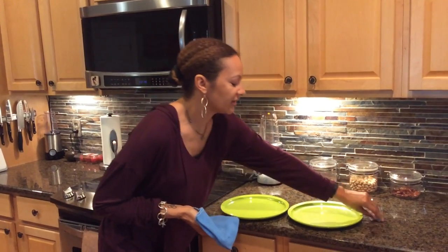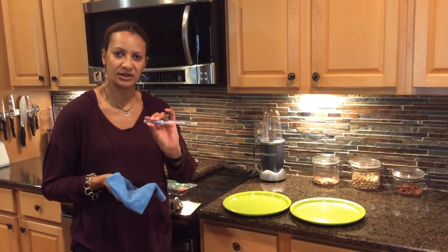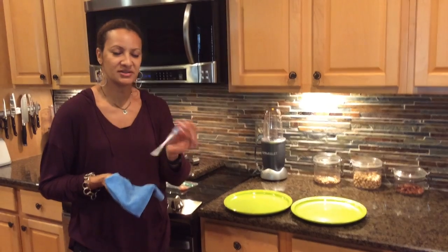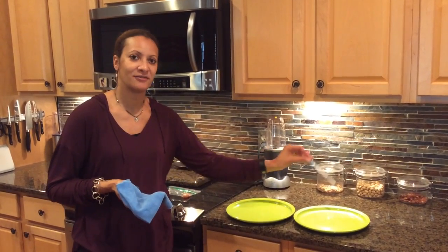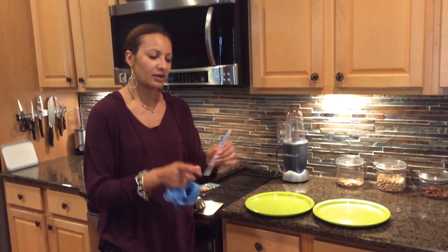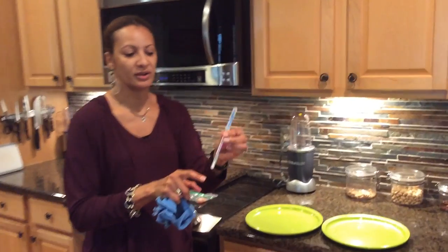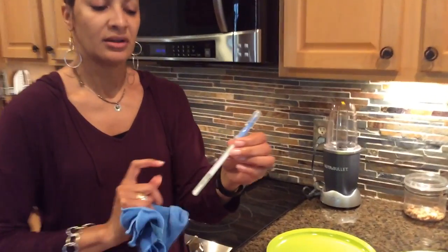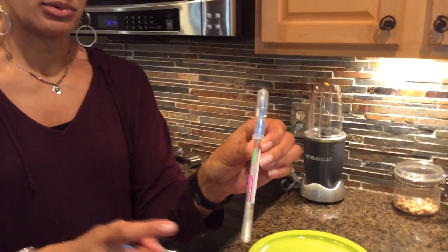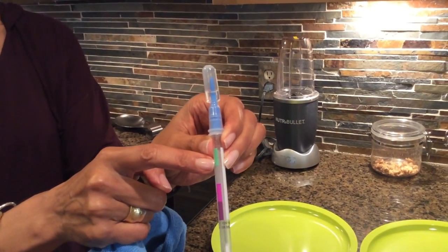I have two plates here and I have a swab tester. This is from ProClean — it's not sold by Norwex. This is what they use in restaurants to test to see if there's bacteria or protein present on the counters. There's a liquid in the top of the swab that comes down to touch the swab. And if there is protein or bacteria present, it will turn purple. If not, the liquid will turn green.